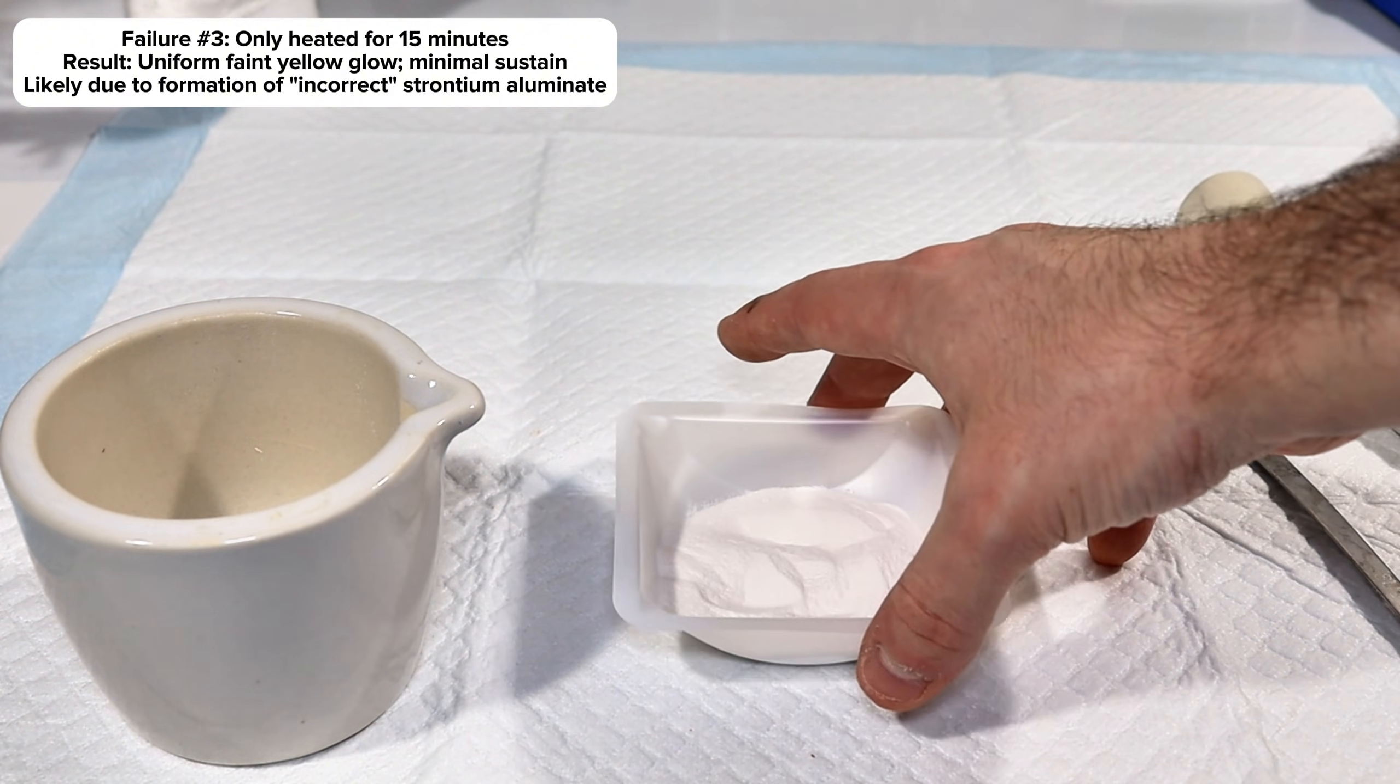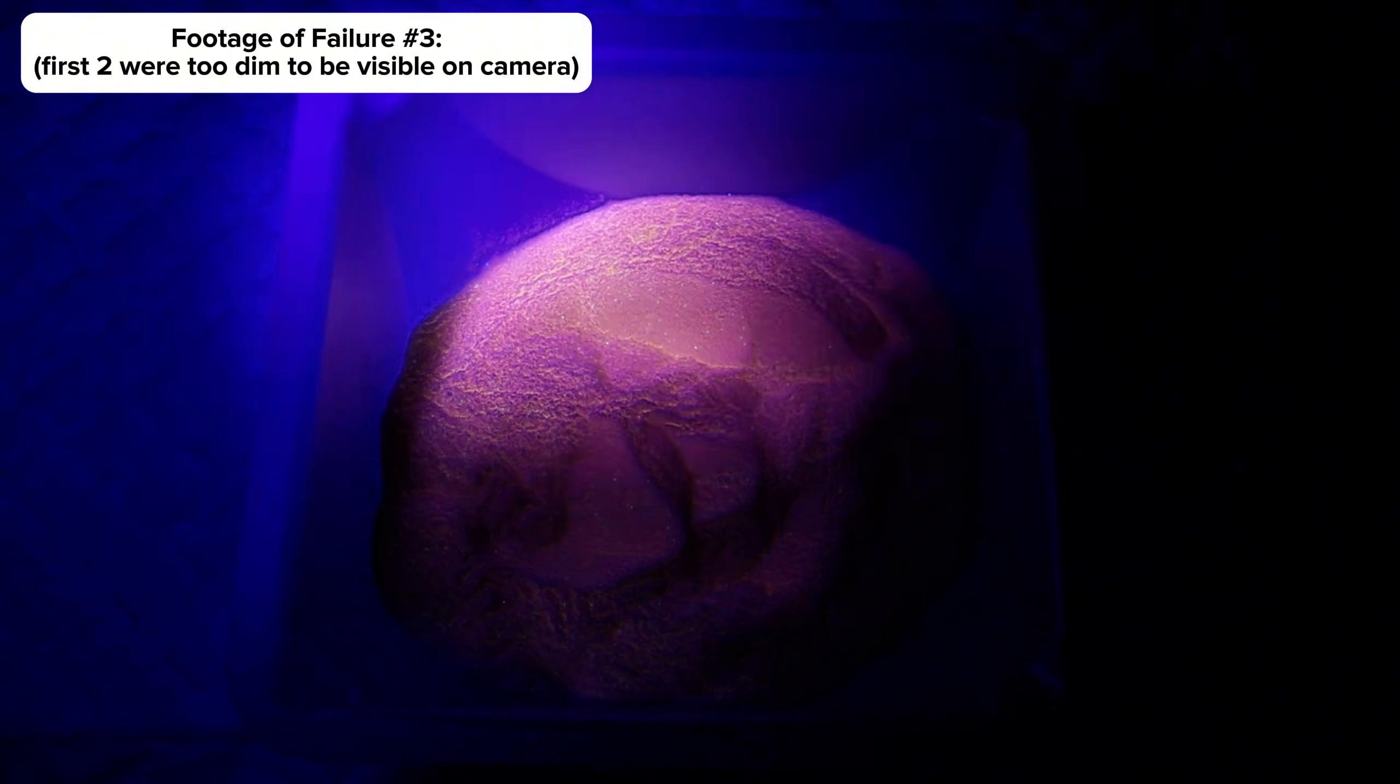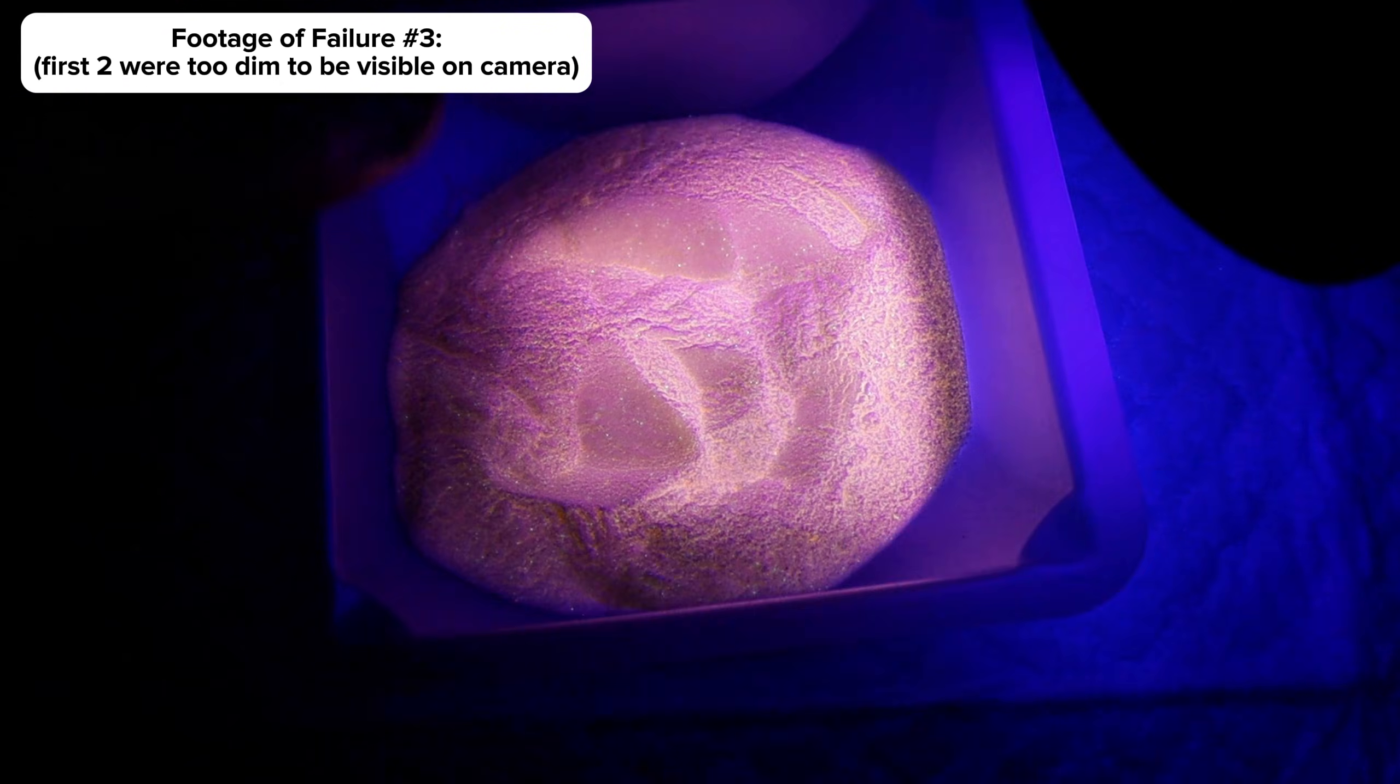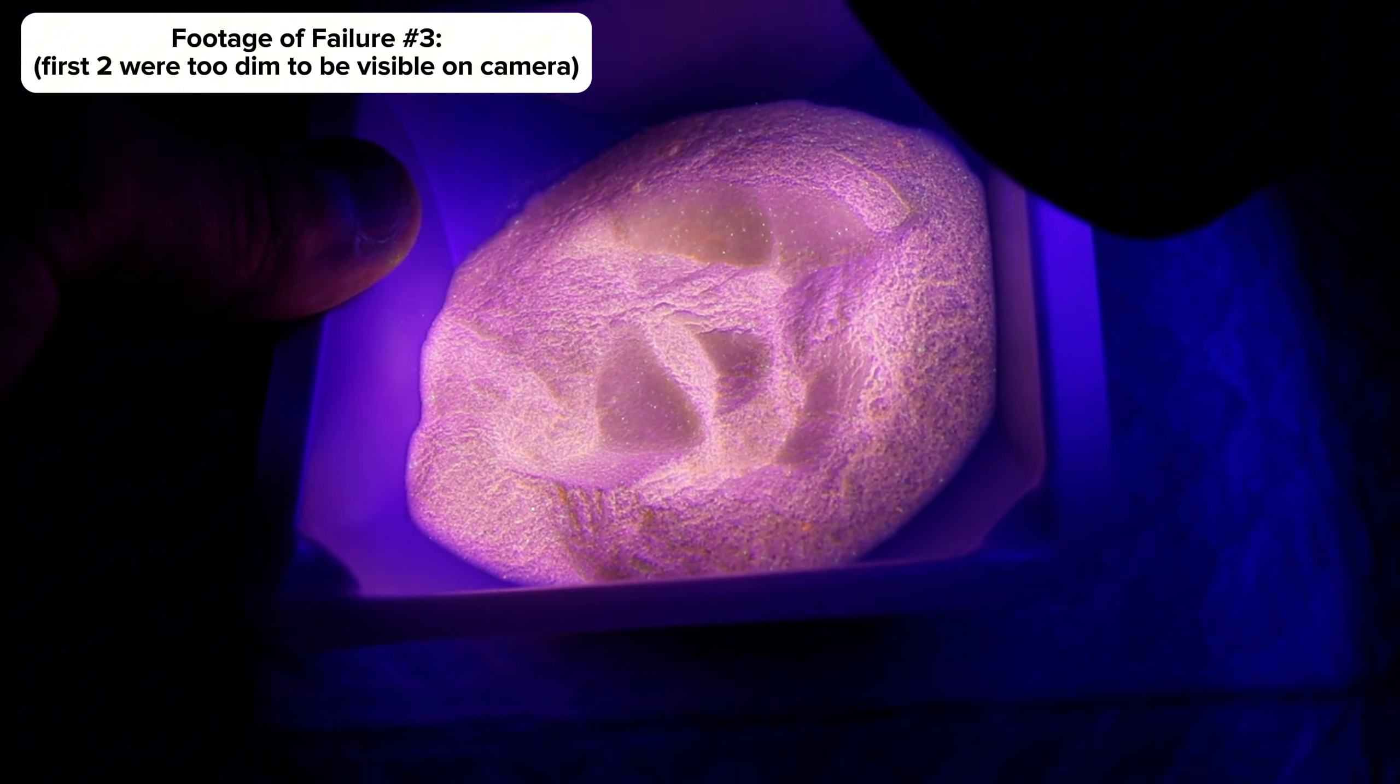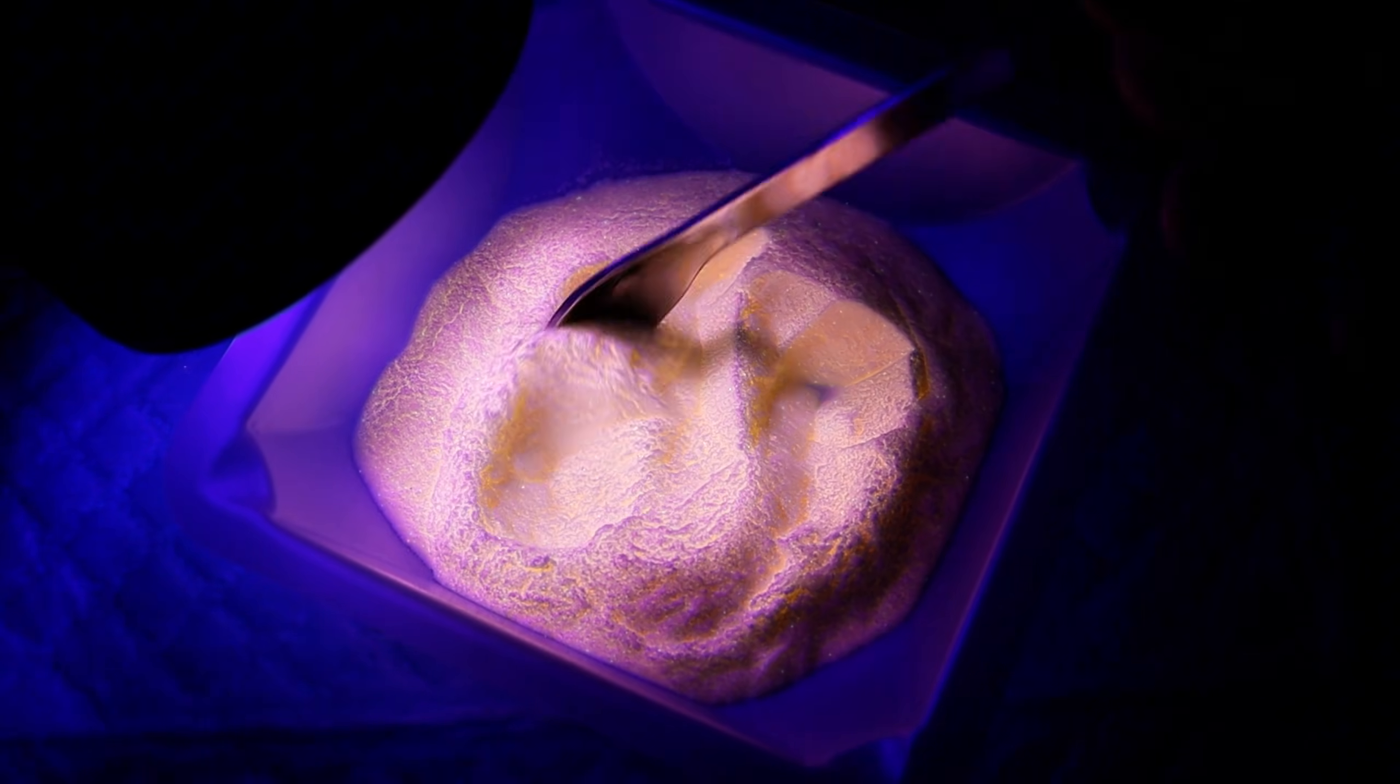This third batch produced the same faint yellow glow as the second, only completely uniform this time which I figured was at least something of an improvement. At first, I thought this was a problem with the new method, figuring that nitrate would almost certainly oxidize europium to its trivalent state, especially at such high temperatures. However, since the yellow color was unchanged from the second run conducted without the presence of any oxidizing agent, I figured it was more likely a problem with the reaction temperature.